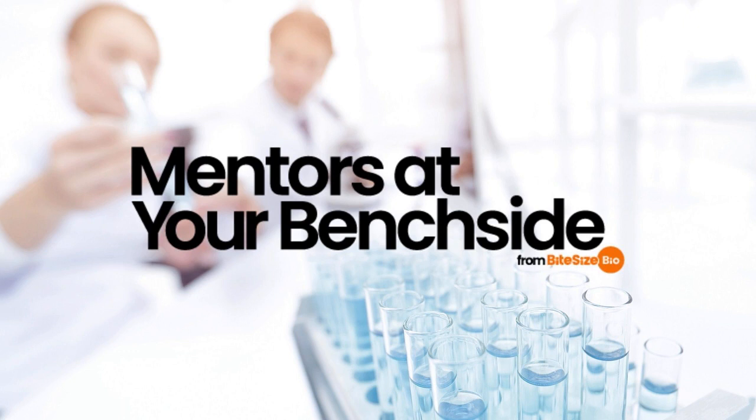You likely have a good understanding of the difference between accuracy and precision. Since accuracy and precision are fundamental to almost all the sciences, they are typically one of the first subjects covered in introductory STEM courses. With that said, let's get a quick refresher before we proceed to the consequences of misunderstanding accuracy and precision in the lab.